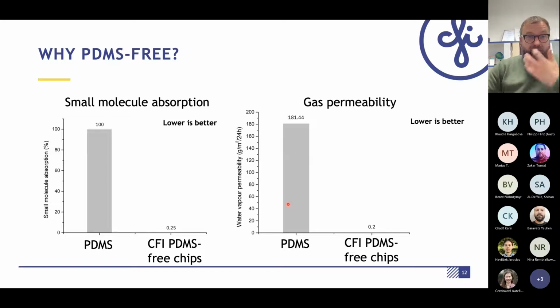So the question is, why PDMS-free? There are mainly two advantages or disadvantages of PDMS. PDMS is a really very nice and quite easily producible material, but it absorbs small molecules, which is not good, especially when we want to treat the cells inside the chip, and of course there is gas permeability.